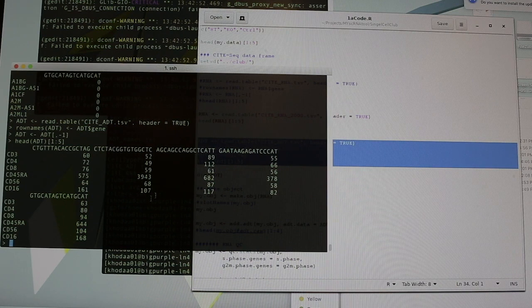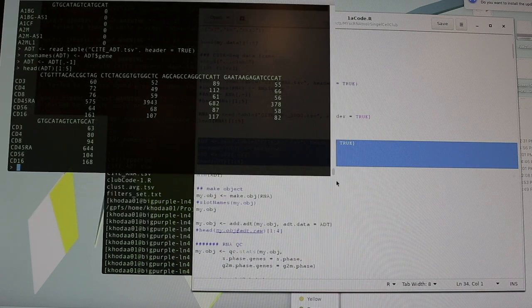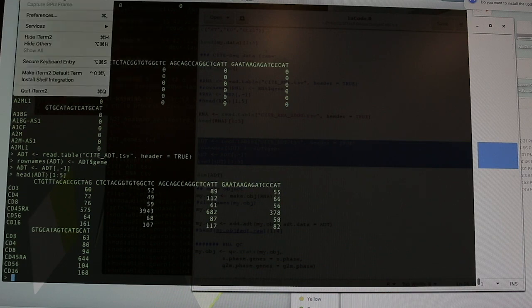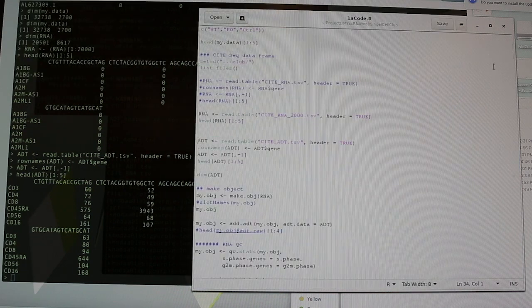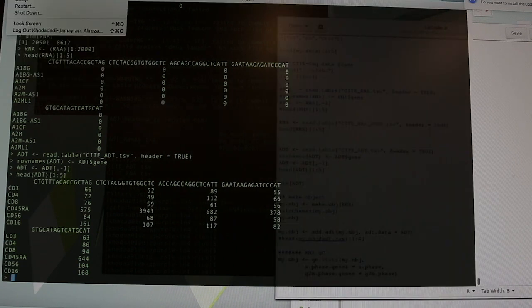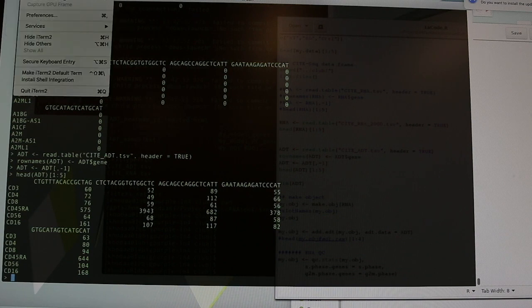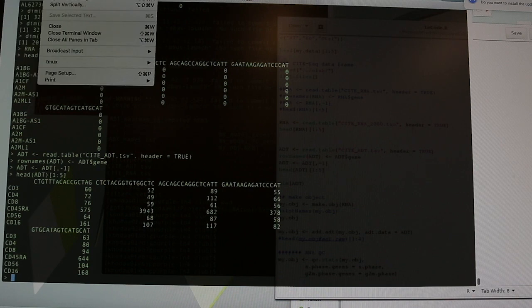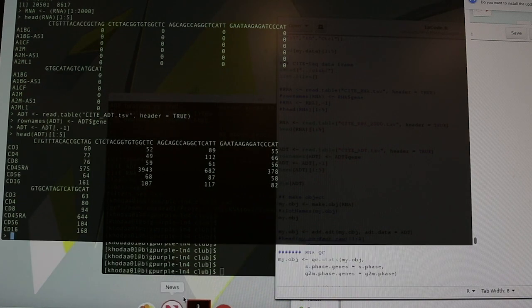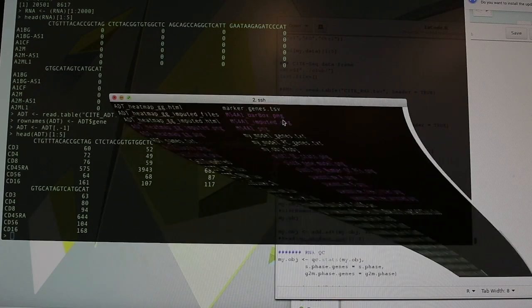Do I make the windows and text a little bit bigger? Because it's hard to see. Sure, of course. Maybe I can close the back too. Minimize this one, it's better. I'm gonna make the transparency go away. I wasn't prepared for this. Is it clear enough?